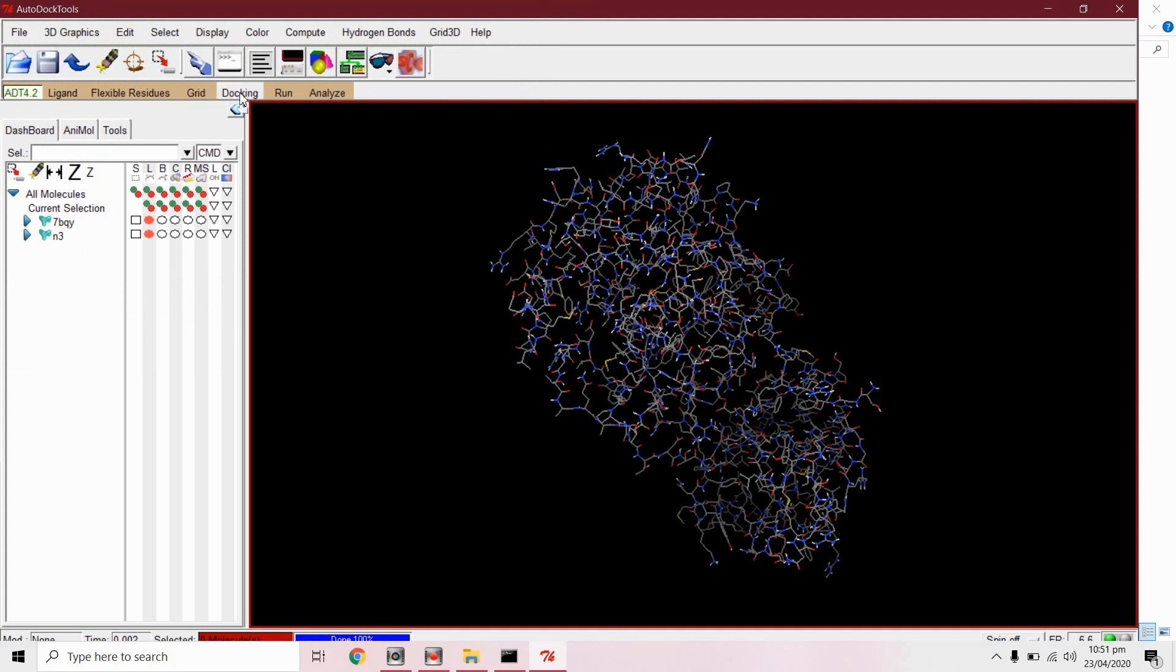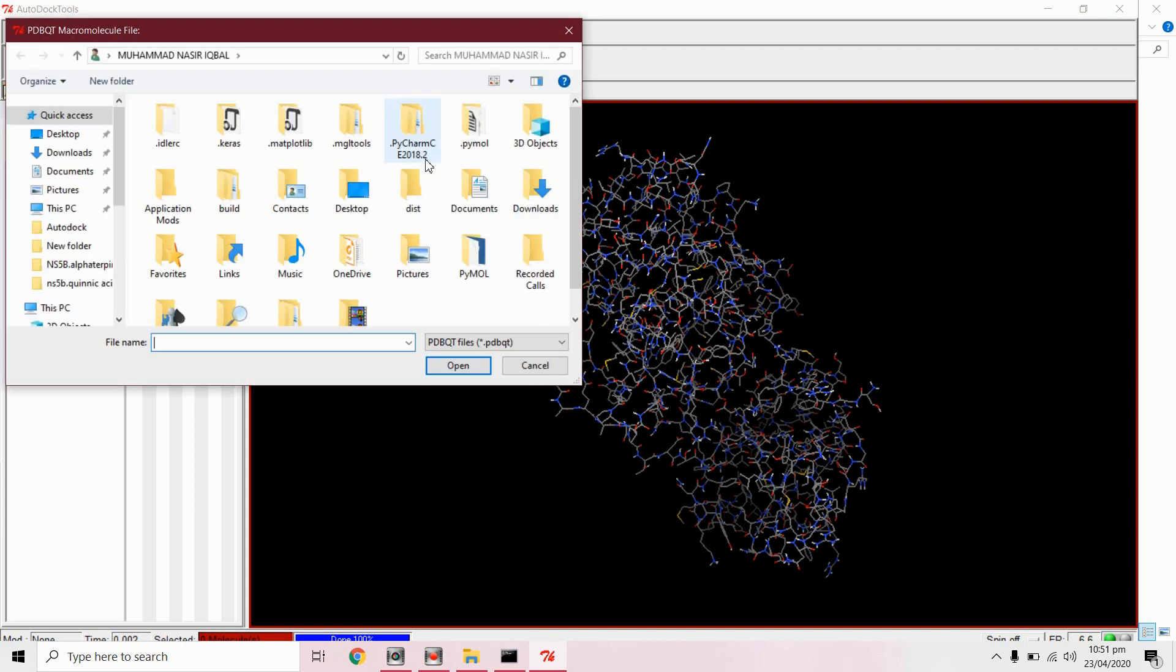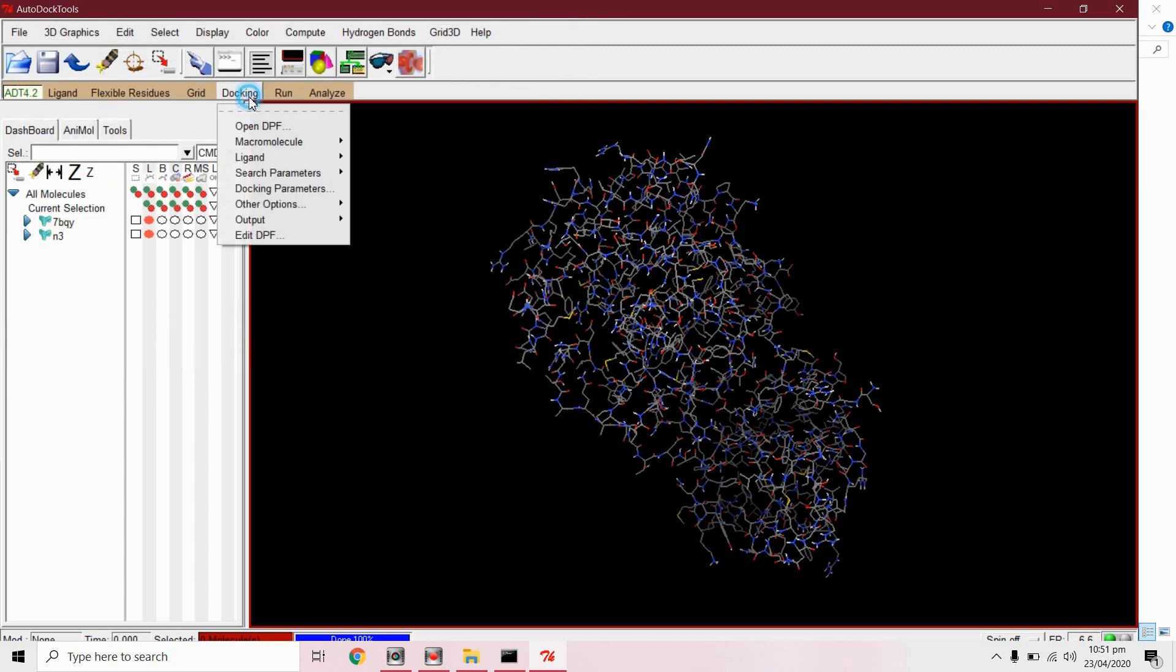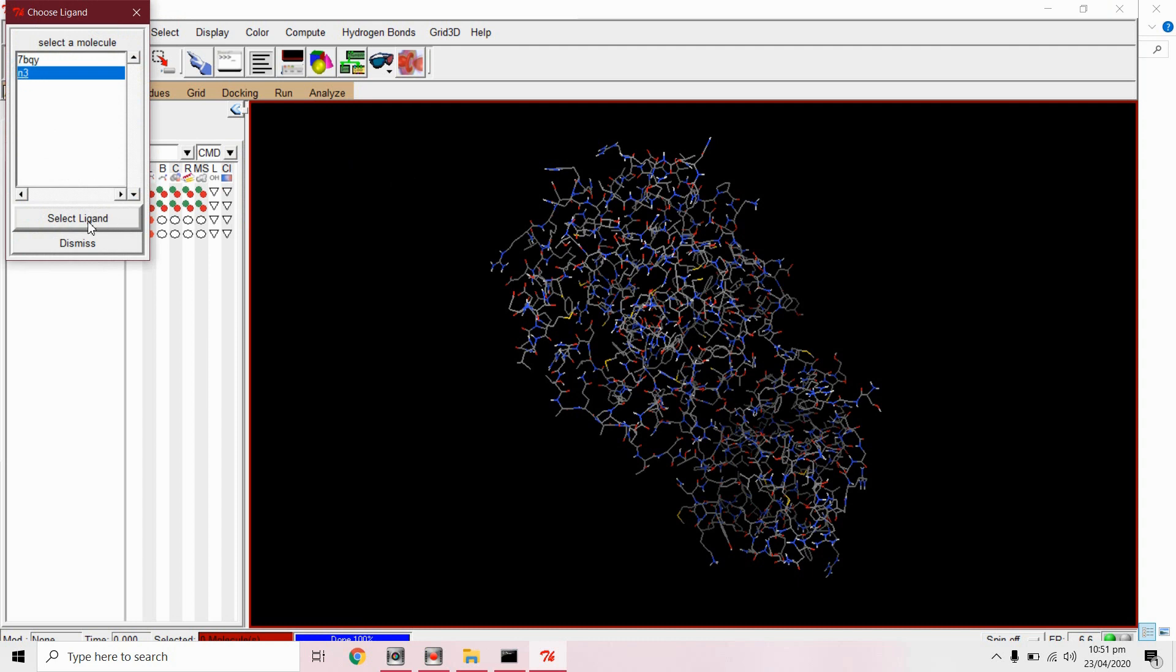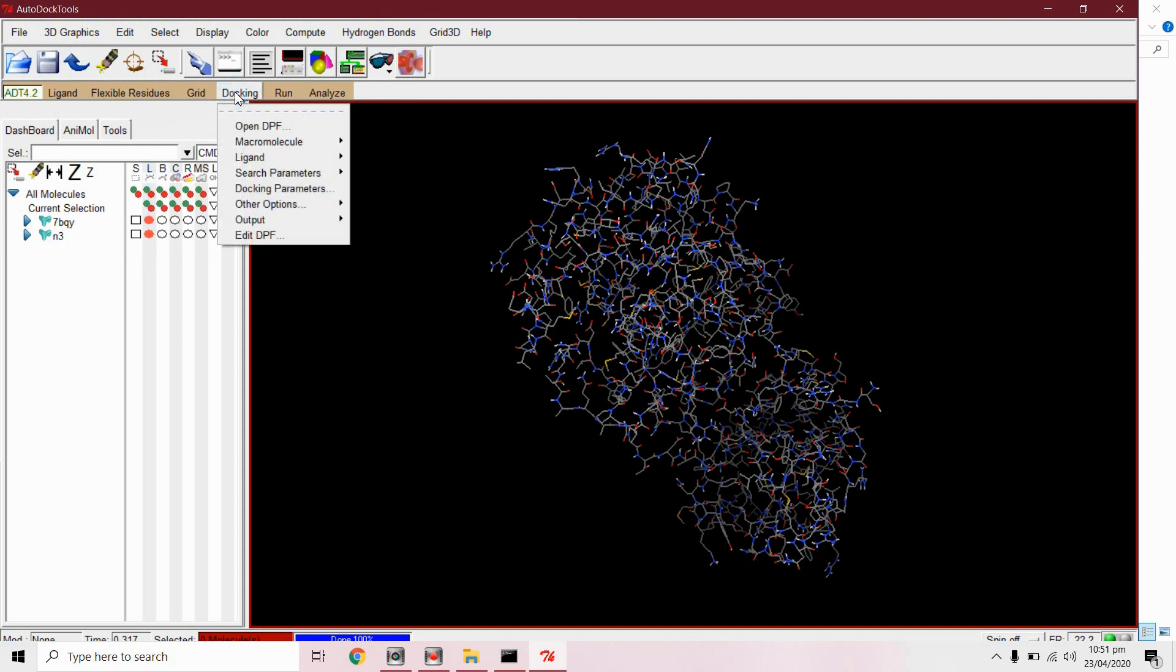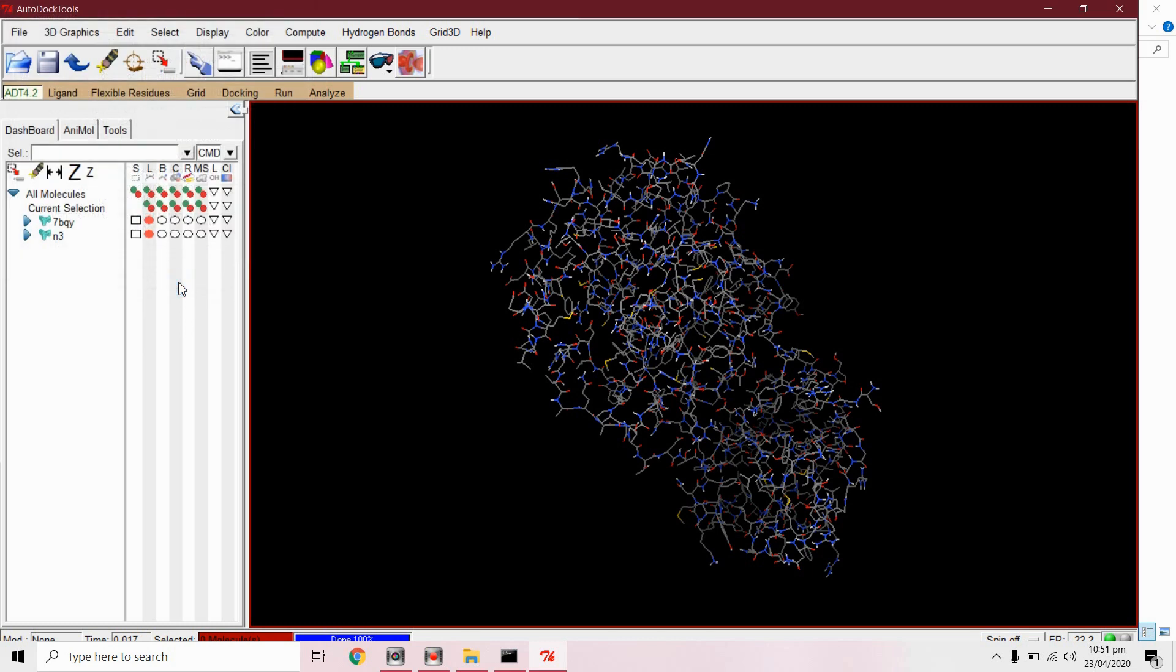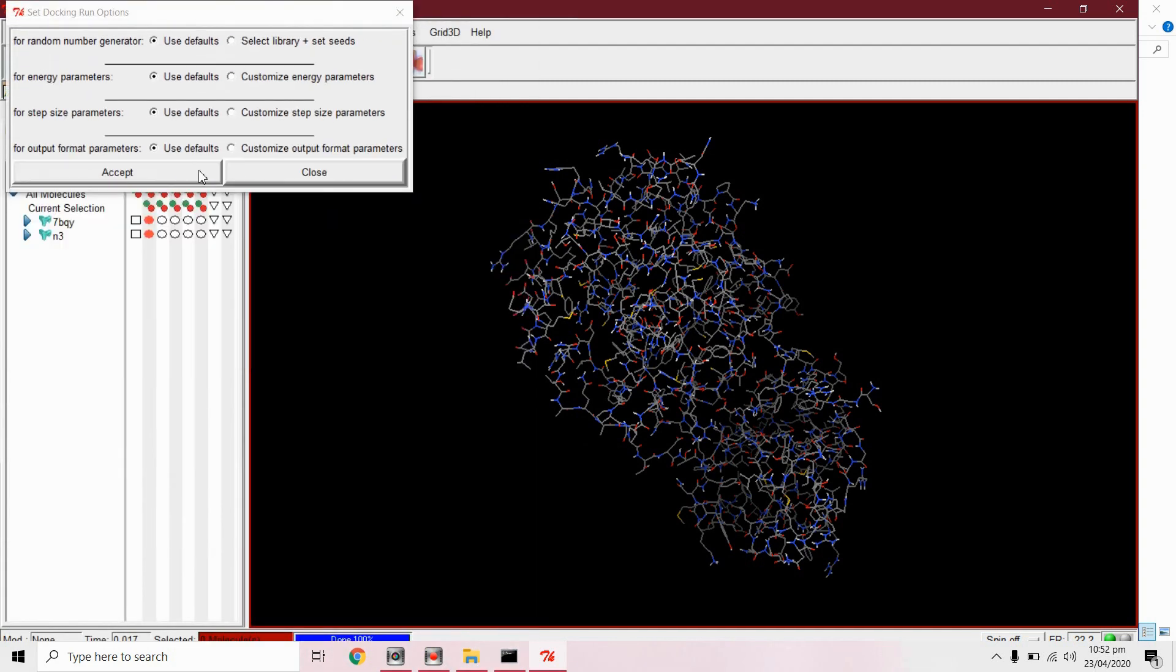From docking macromolecule set rigid file name and we will select protein file dot PDBQT. Now from docking ligand choose select the ligand. From docking search parameters genetic algorithm accept with the default parameters. From docking docking parameters accept them with default parameters.